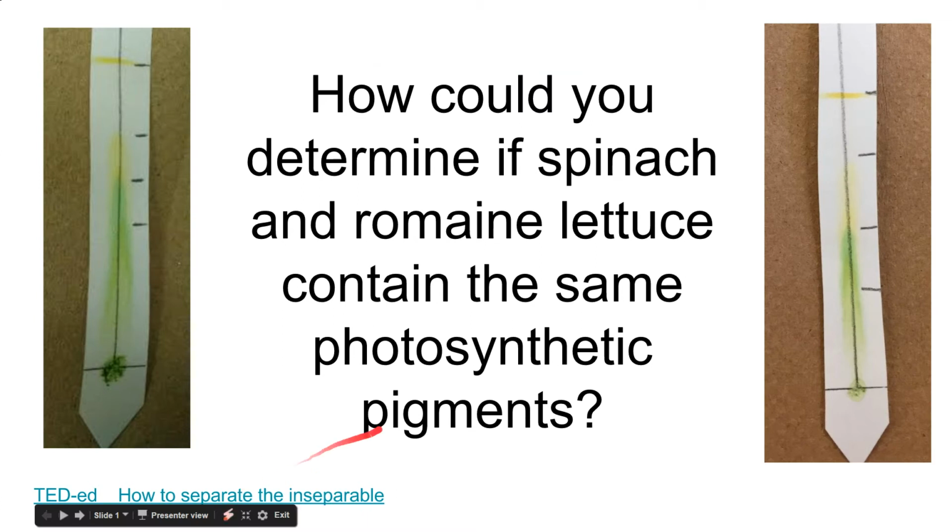All right, everybody. So we are getting into DNA restriction enzymes and gel electrophoresis. But before we get there, I want to try and refresh your memory and think back to doing paper chromatography.